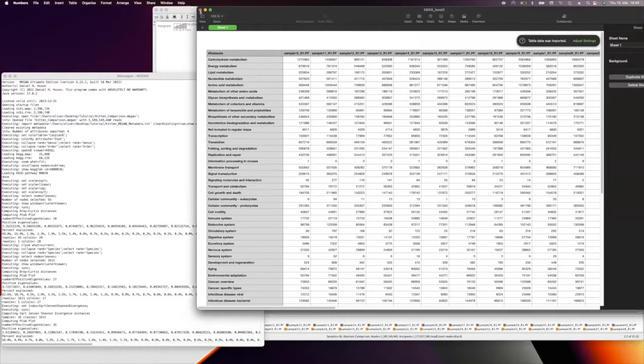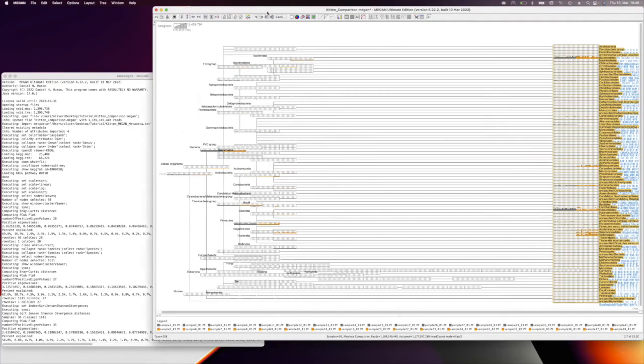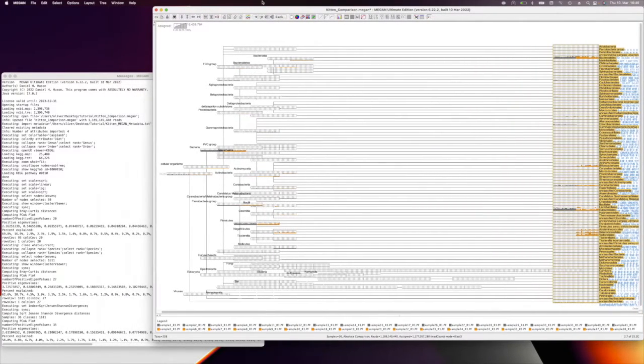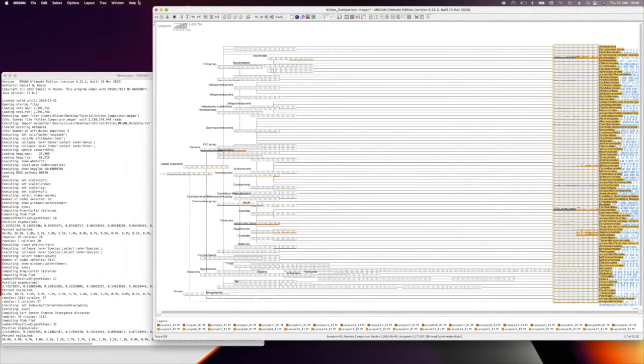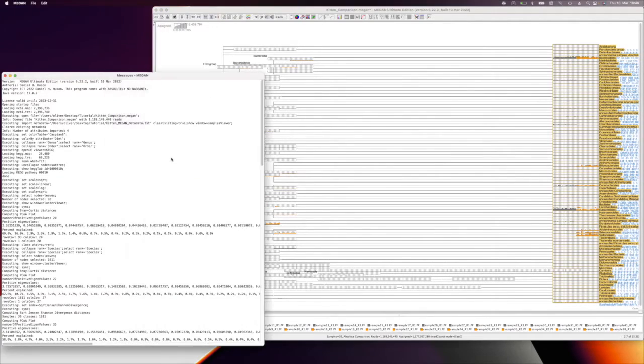And again, if you want to generate your own MEGAN script, it can be quite tricky to start with, but it's definitely worth automating some of your workflows. So use the message window, and also the window command syntax.